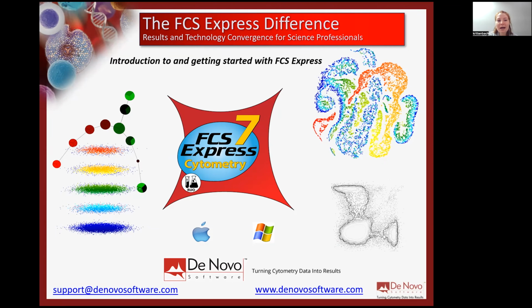And so I am Catherine Rittenbach. I'm a technical applications specialist with De Novo Software. And today we're going to be going over how FCS Express can help benefit your analysis with flow cytometry data.